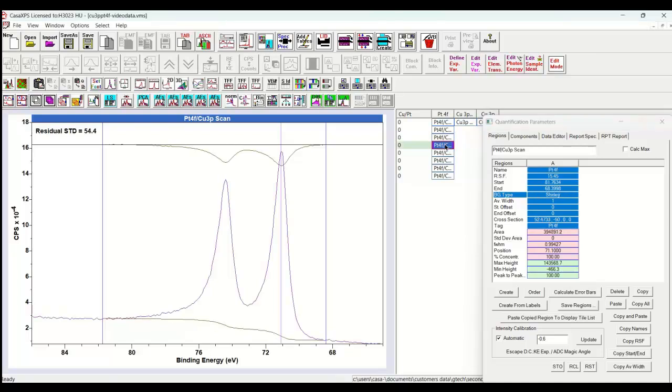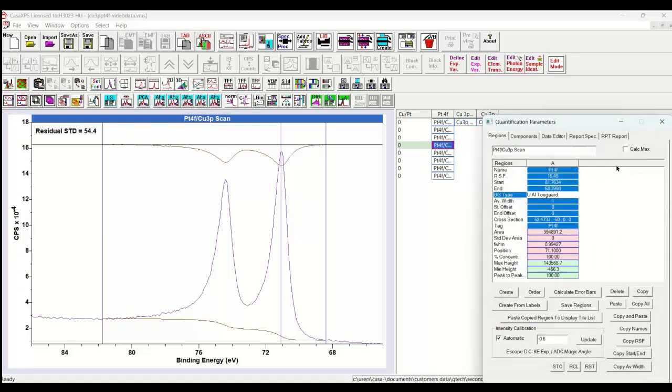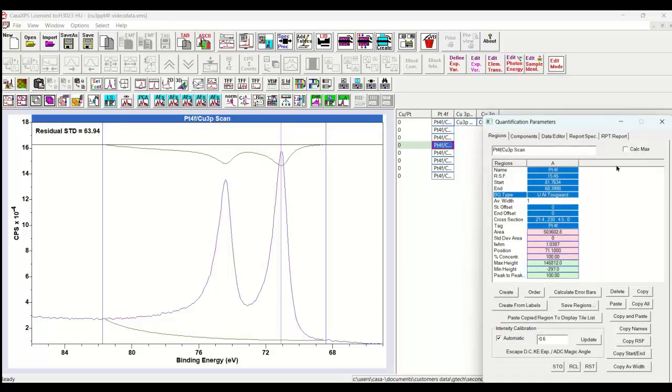So there's another background. What else can we use? We could use an aluminum background. This is another Tougaard background, a U aluminum Tougaard background. These are cross-sections that have been designed for aluminum. That's totally inappropriate for these data, but let's just illustrate what they look like. And we get a completely different shape to the background. So the background that we're choosing makes a difference to the shapes of these peaks.